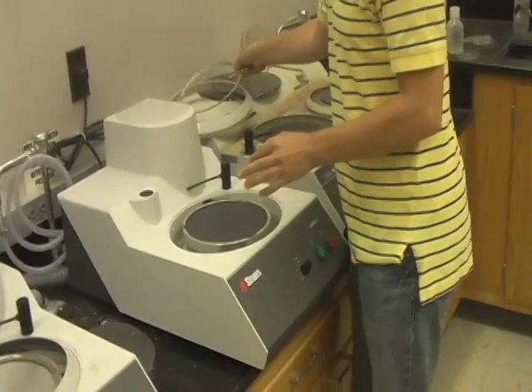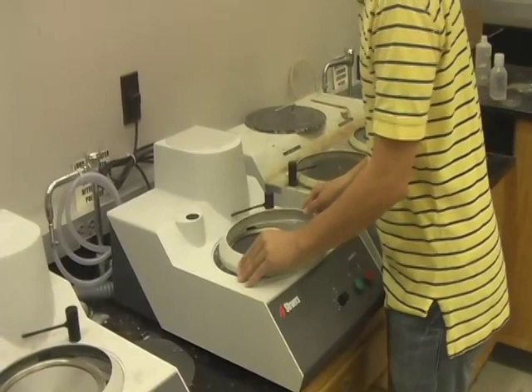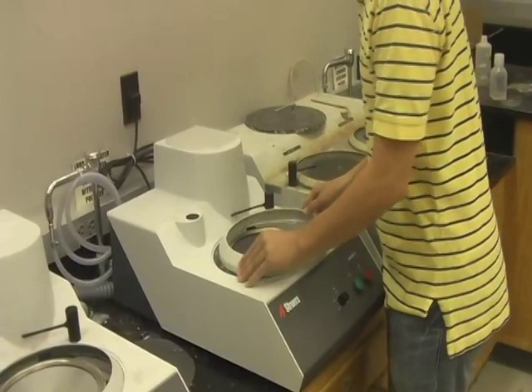Finally, take the metal holding ring and place it back onto the machine. This secures the grinding pad onto the turntable. Then take the plastic ring and place it back onto the machine. This will prevent splashing from the water.